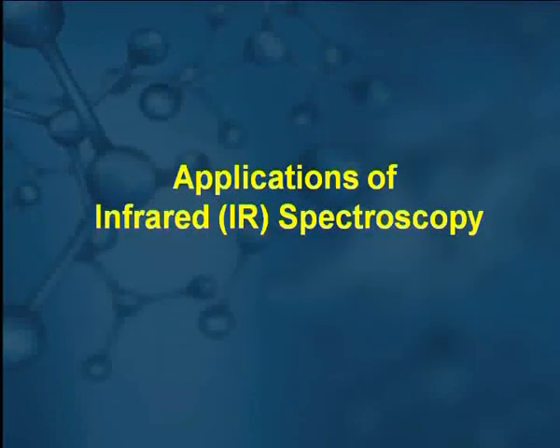What are the applications of infrared spectroscopy? Where can we use IR spectroscopy? The main use of infrared spectroscopy is in research purposes. It has been of great significance to scientific researchers in many fields such as protein characterization, nanoscale semiconductor analysis and space exploration. Various gaseous, liquid and solid samples can be analyzed by using IR spectroscopy. So in research, IR spectroscopy plays a very important role.